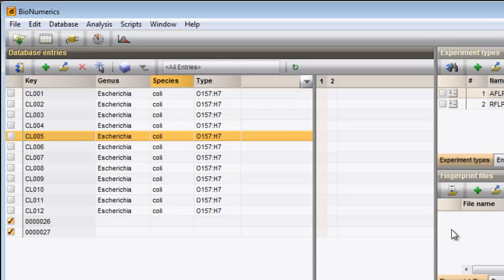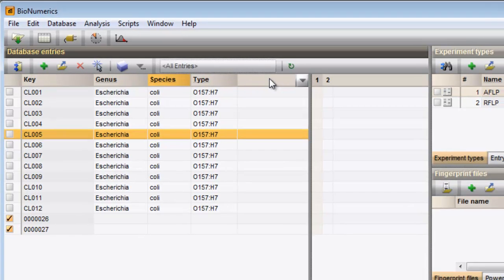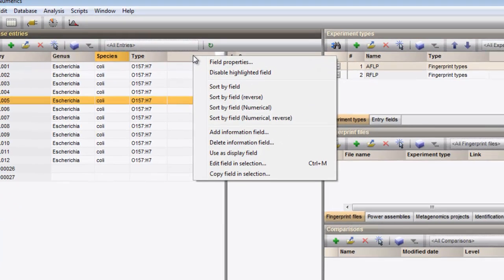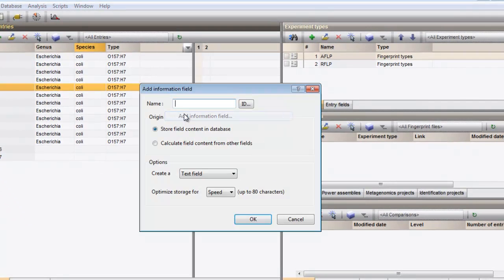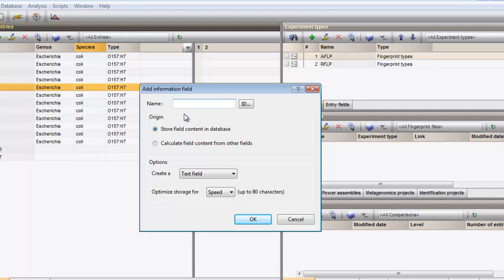New information fields can be added to the database by right-clicking in the header of the panel and selecting Add information field. In the text box, I need to enter the name of the new field.